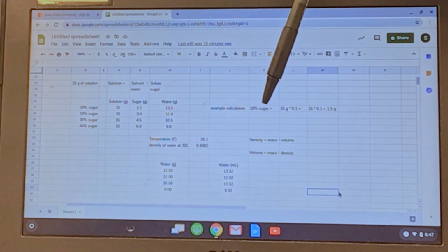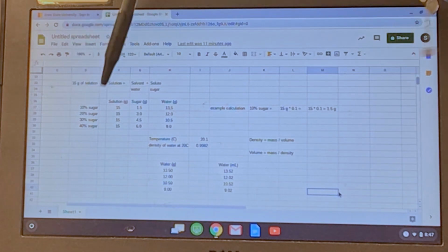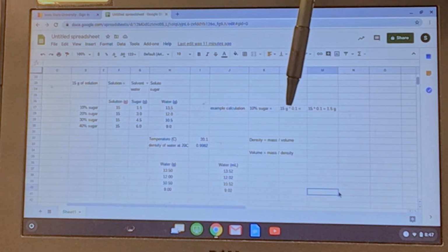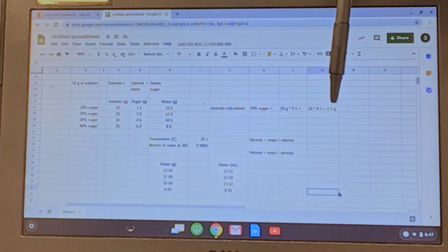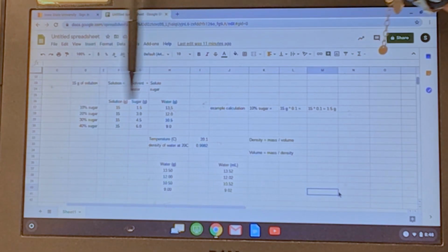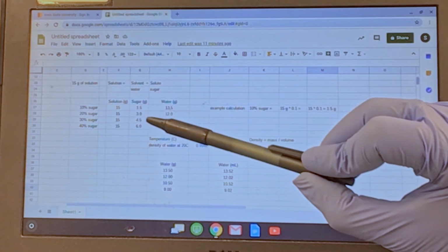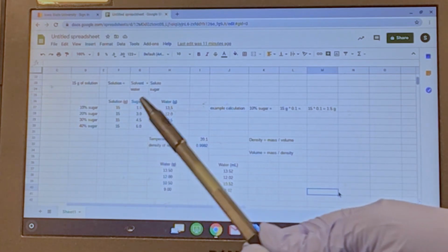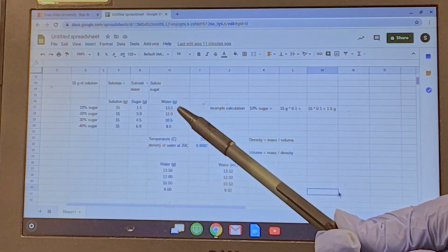So 10% sugar weight by weight means that in these 15 grams of solution that I need to make, 10% needs to be sugar. So if I multiply 15 grams times 0.1, 10%, I will get that I need to weigh 1.5 grams of sugar. So for 20% sugar solution, I will need to weigh 3 grams of sugar. For 30% solution, I will need to weigh 4.5 grams of sugar. Then I just need to subtract the sugar mass from the solution mass to find how much mass of water I need, okay?